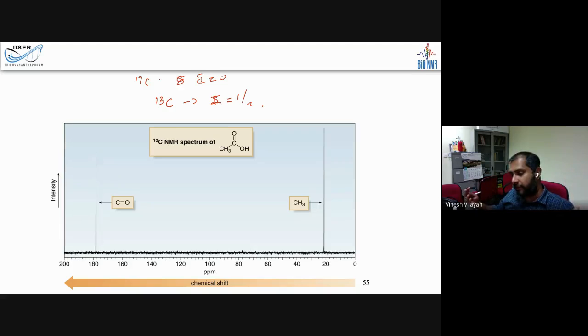Okay, so out of 100 molecules of methane, one methane molecule will have carbon-13 as its carbon environment. So the sensitivity is going to drop relatively. Also, the gyromagnetic ratio of carbon-13 is 1/4 that of hydrogen, so it is also very small. So your sensitivity, M0, is really going to be small, hence the sensitivity is very much worse than proton or hydrogen NMR. Okay, but still one can do it.